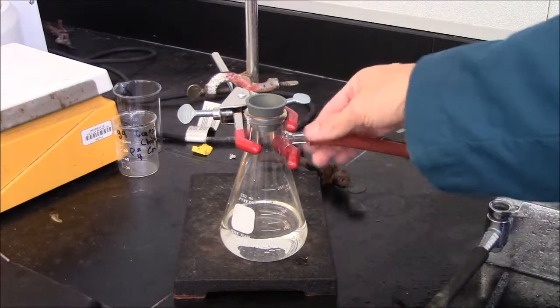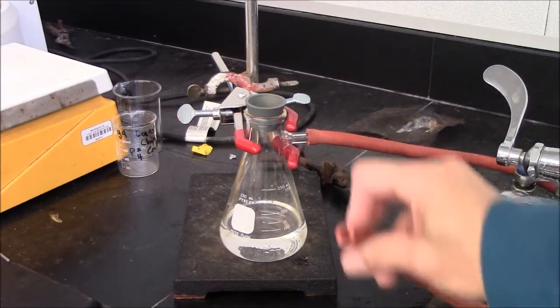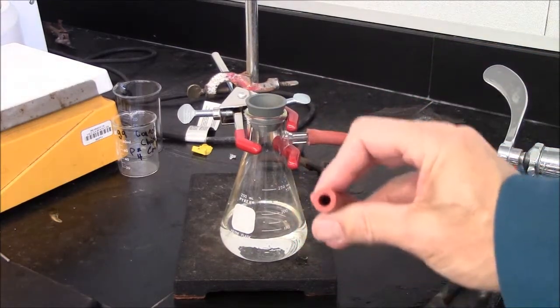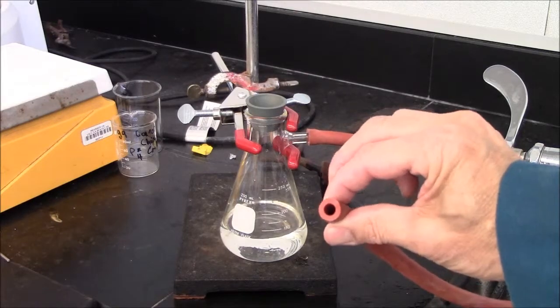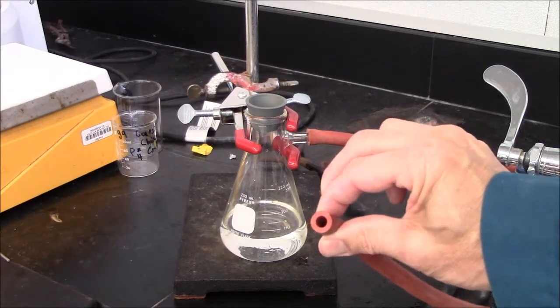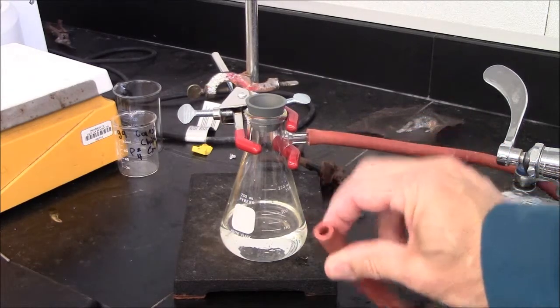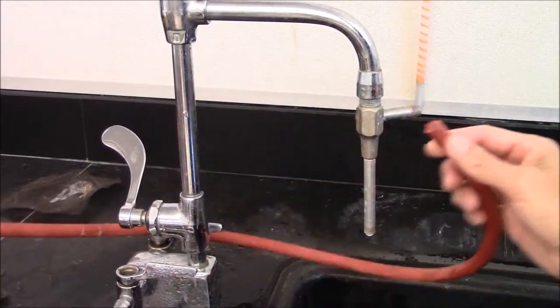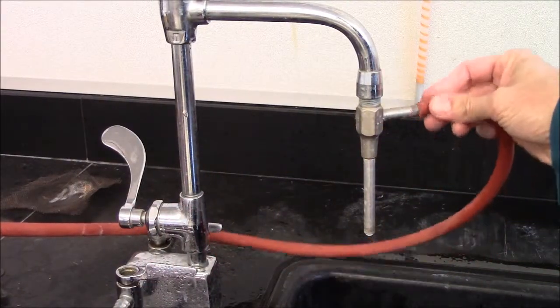This is a vacuum flask. It has a side arm. You need to attach vacuum tubing. This is thick wall tubing that will not collapse when pressed on by atmospheric pressure. The end of the vacuum tubing attaches to the aspirator here.